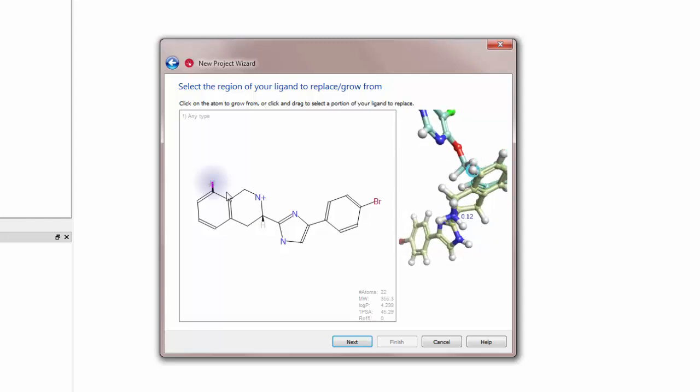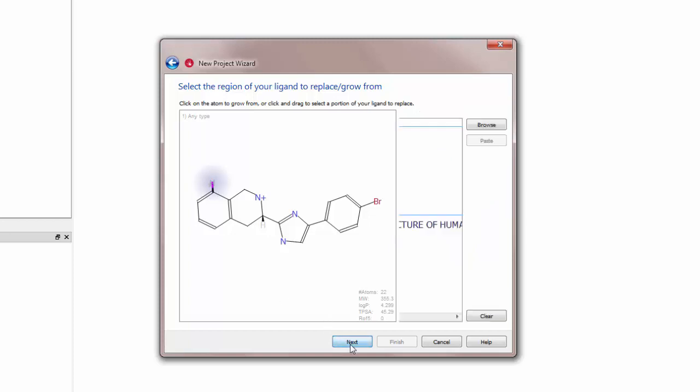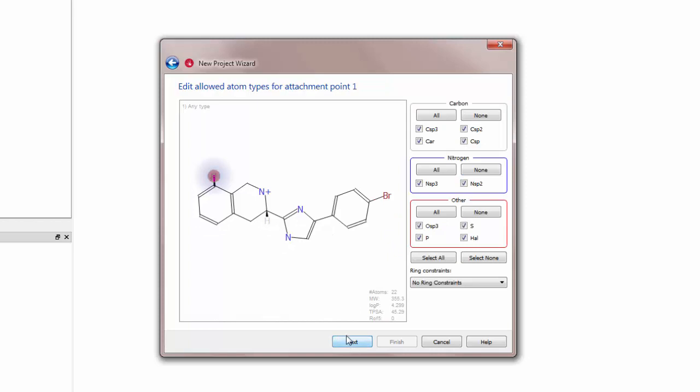A hydrogen is placed for the attachment point and this is highlighted in the 3D view. Clicking Next opens the attachment point conditions. I will leave this without any conditions as we will establish a condition based on the fragment database to be searched.